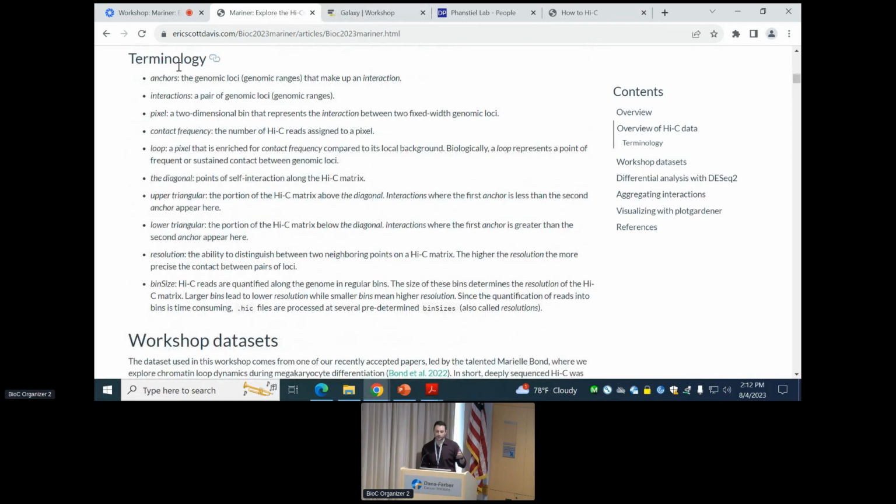And there's a little terminology section. So if any of that was confusing, or if you want to go back and reference, this is just my off the cuff definitions of these things, not necessarily official or agreed upon by everyone, but this is how I've used these through the software and through the rest of this.